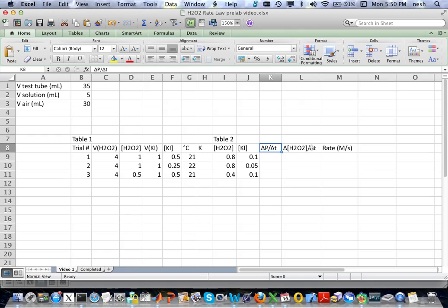So let's see. The first one, I just want to check to see how you're doing on this. You want to do a calculation based on the degrees Celsius and do a fill down. Why don't you try that? Okay. Here we go. I'm going to say that's equal to the degrees in Celsius plus 273, and hit return. That looks pretty good. And now I'm going to go into the lower right, double click, and that gives me those temperatures.